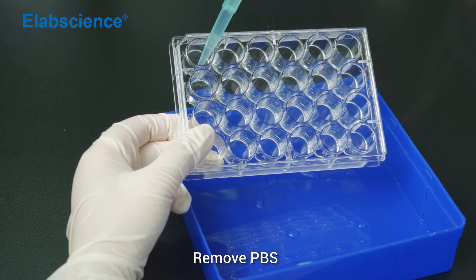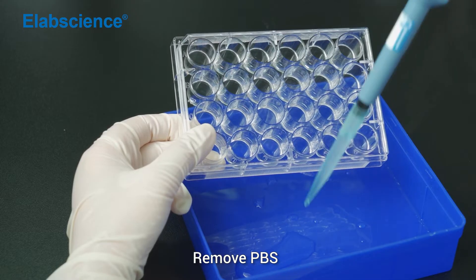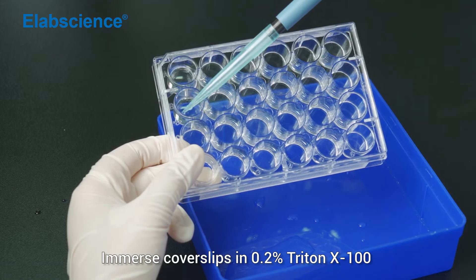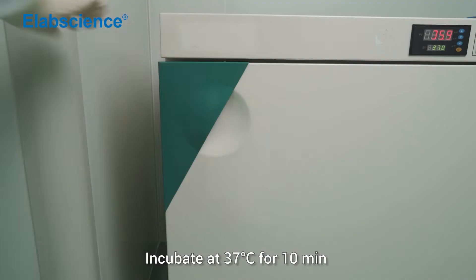Remove PBS. Immerse cover slips in 0.2% Triton X-100. Incubate at 37 degrees for 10 minutes.